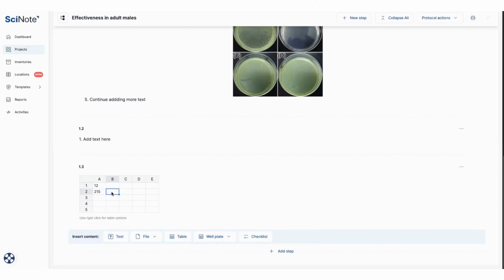At the end of this year, we're completely revamping these tables and introducing a much more upgraded version of them that will support an even broader range of formulas, as well as make the cells more dynamic, bringing the functionality and experience a bit closer to what you would find in, say, Microsoft Excel. So it's not available today, but it's coming very soon.